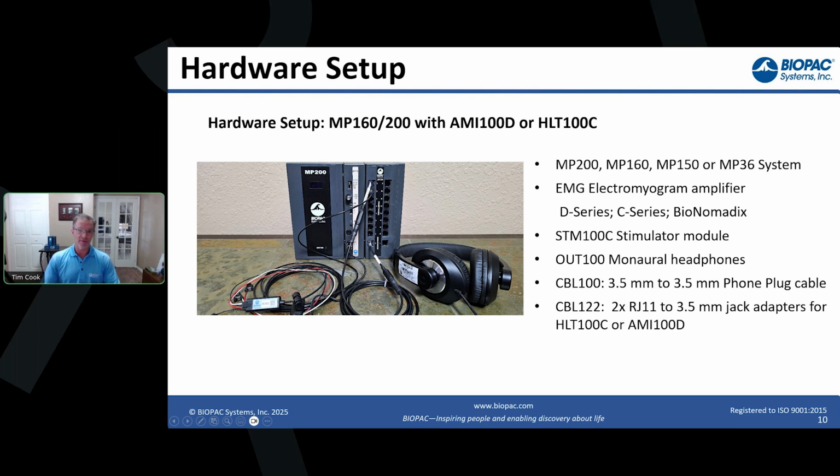So knowing that it's a fixed delay, you can adjust for that in the software, because in something like this, the timing is extremely important. You'd want to adjust the EMG with that fixed delay and time it back a little bit so that everything is aligned, because again, we're looking at millisecond timing.